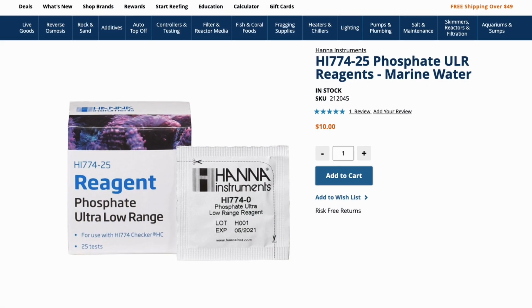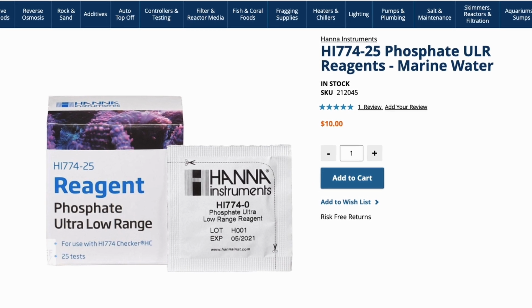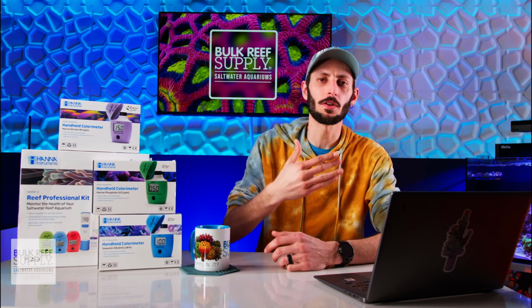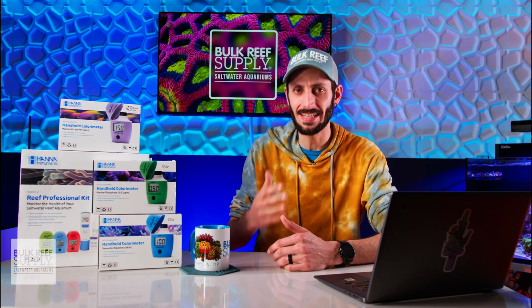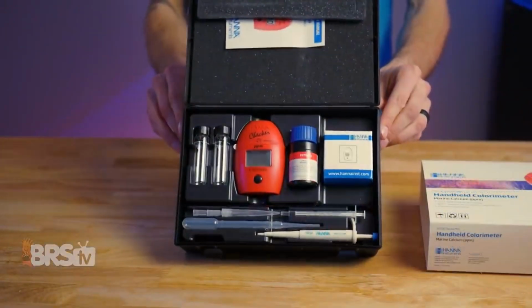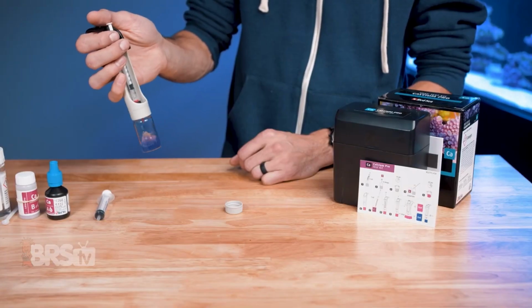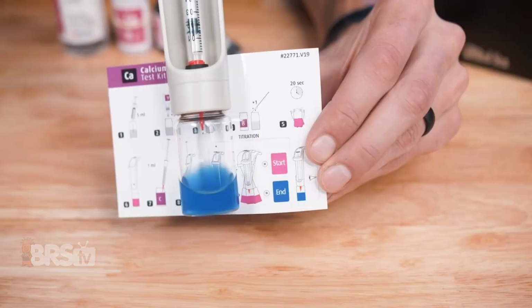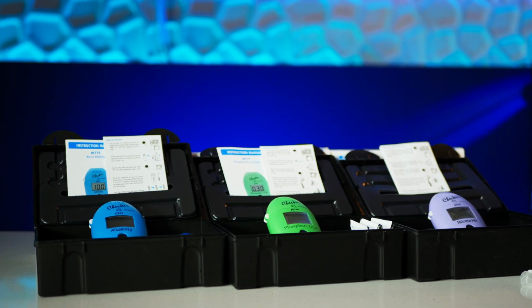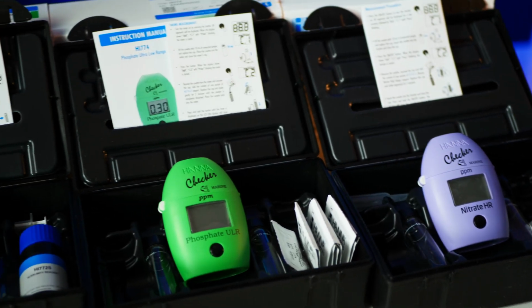Plus, the reagents aren't going to break the bank, so the biggest cost is the initial purchase of the checker itself. Now, onto that asterisk, some of the Hanna checkers are a bit more involved, take longer to perform, and can be a little bit tricky. Namely, the calcium and the low-range nitrate checker. So they may not be worth it unless you have real trouble with matching color charts and telling the subtle differences between shades or end colors with regular test kits. But for the majority, like alkalinity, phosphate, and high-range nitrate, heck yeah, they're worth it.